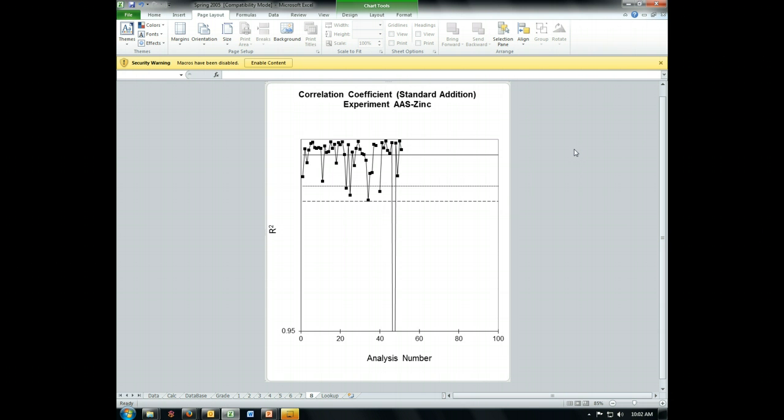So that's a quick look through a quality control spreadsheet. You'll see that it gives you some more information about how you'd handle that, and some information about blanks. We'll do those sort of things in our workshops, but we'll also see that as part of our reading in Chapter 5.